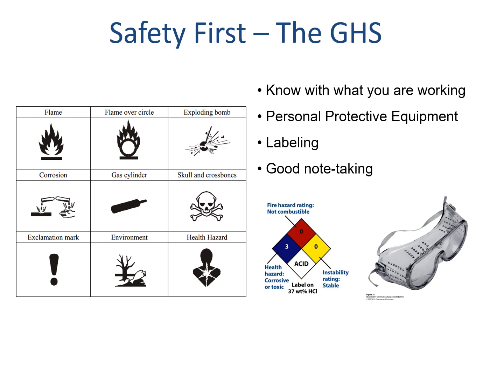Gas cylinders are reserved for cylinder gases. We have a few in the lab: argon tanks for our microwave plasma instrument, and helium for our gas chromatograph mass spectrometers. These are strapped for safety, so you shouldn't need to worry about these hazards, but there are special handling instructions for cylinders.